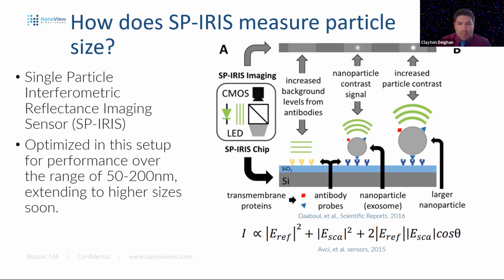And we're able to take these chips and functionalize them for more than one marker at a time. So when we're looking at these pull-downs, we're looking simultaneously, from the same sample, at different sets of particles. What do the CD81 capture, CD63 capture, and CD9 capture look like independently? This only senses the size. So this leaves us somewhere in between a particle measurement and a measurement of the protein. We know the protein's there because we've captured them. We can sense their size, but we'd still like to know what other markers these captured particles entrain on their surface.